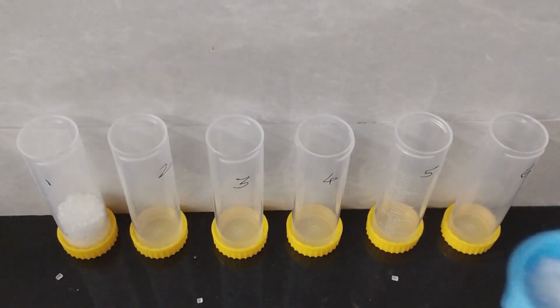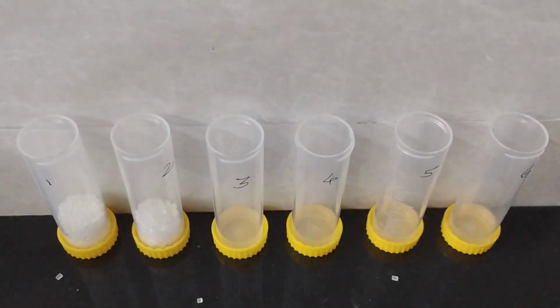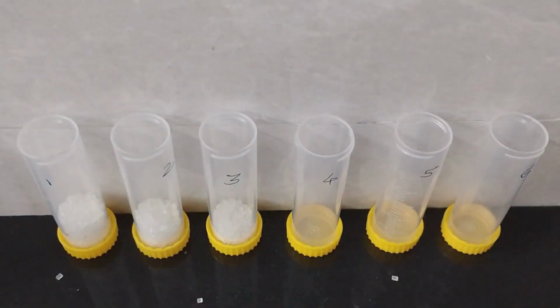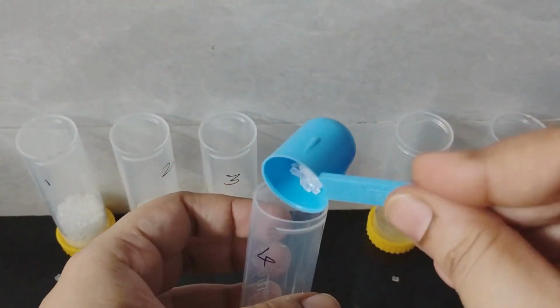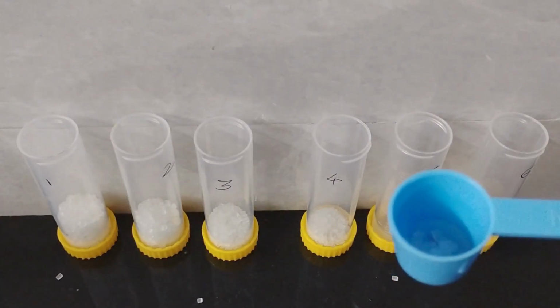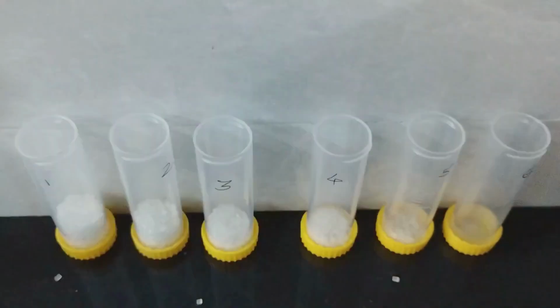Tube 2 gets half a spoon. In tube 3, I'm adding a quarter spoon. Tube 4 gets about half of that. Tube 5 gets just a pinch. And in tube 6, I'm adding no sugar at all. That one is our control.